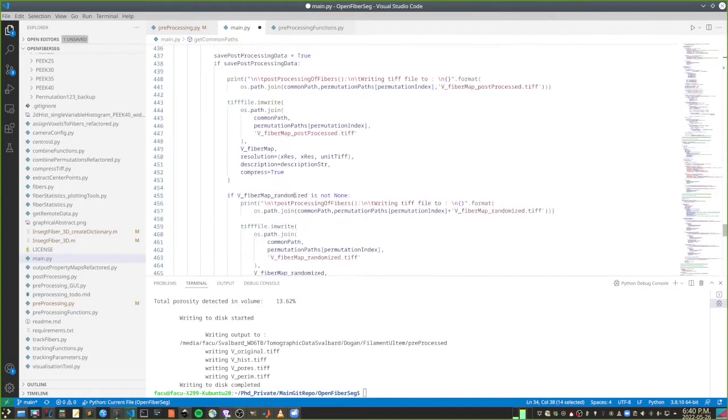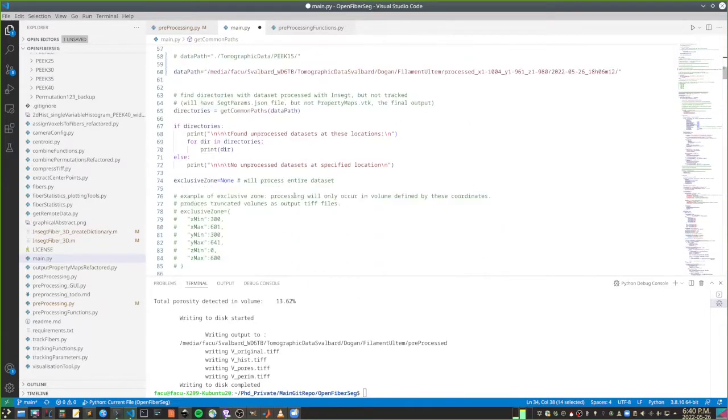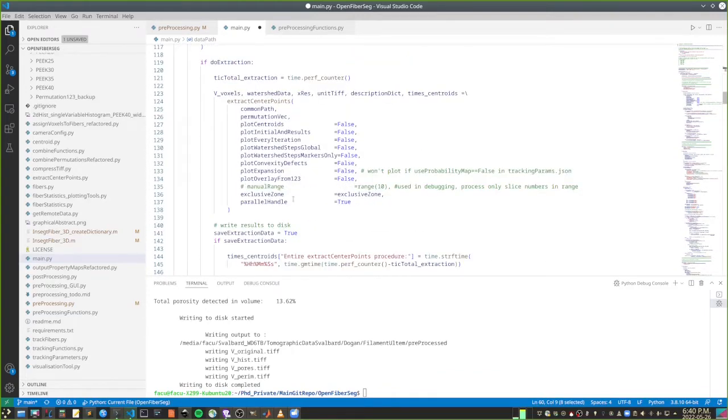Yeah, there's a bit of a mistake, but this is not a problem. I'll fix it. So this is the path. The first step, you can always check if the first step is good. What I usually do is, because I'm going to be plotting just to run a quick check, I don't want to run them in parallel because it's going to take too much memory. I just want to make one file, the first slice, and see if it's good.